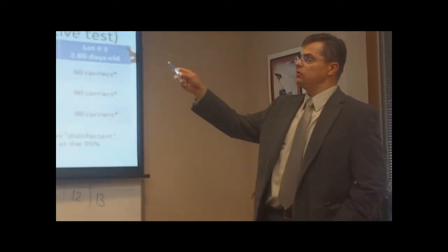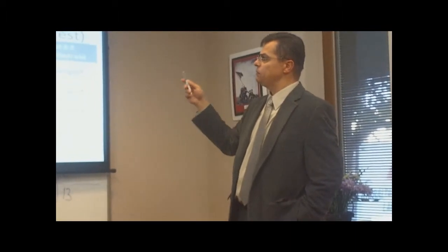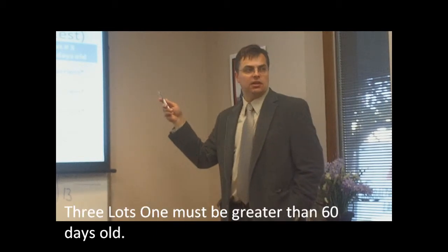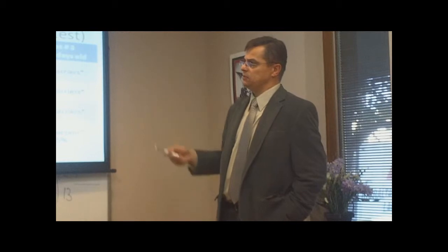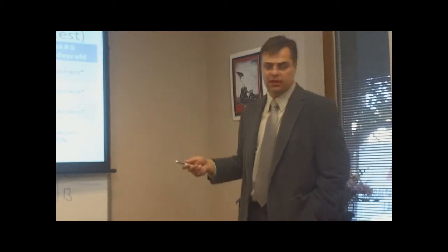You need to do all those 3 organisms, and you need to have 3 different lots from your production of the disinfectant. One of them has to be 60 or more days old, and you need to run all those 3 organisms, which are, again, Staphylococcus, Pseudomonas, Salmonella.